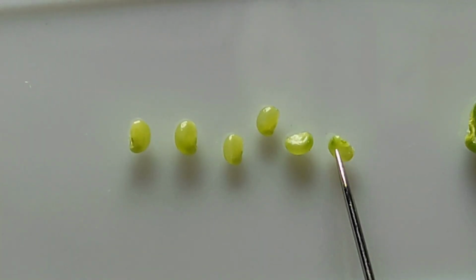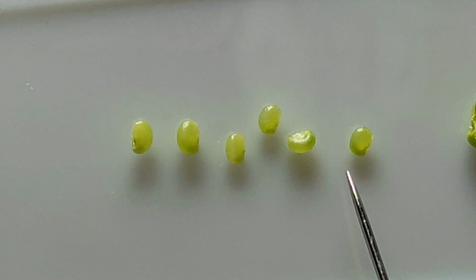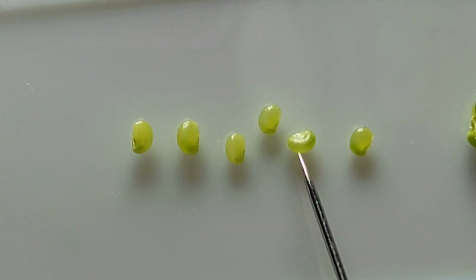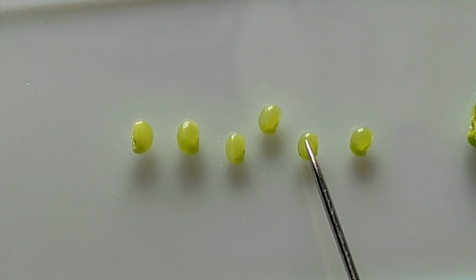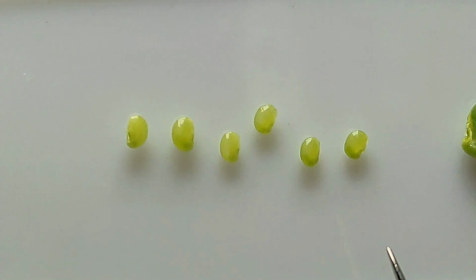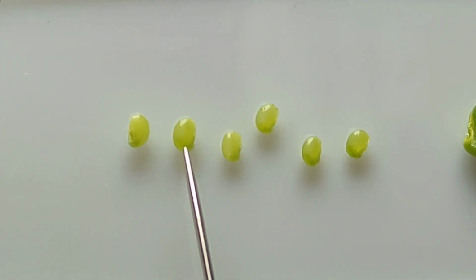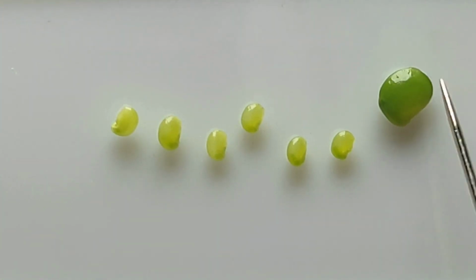Arrange the selected seed in a petri dish or clean glass slide, and here you can see inside the seed, at the micropylar region, a greenish substance which is nothing but the embryo. Here also you can separate out the seed and discard it based on the embryo color and size, with the help of light. Inside the seed, our targeted embryo is pinpoint sized and light greenish. Here you can also see the matured seed greenish inside, having a mature embryo.